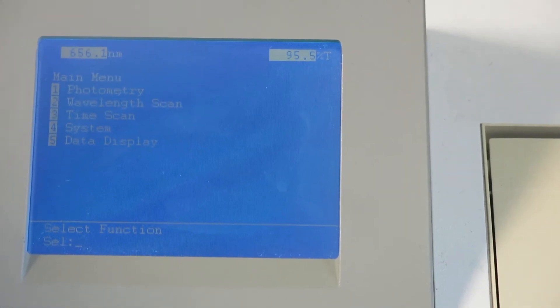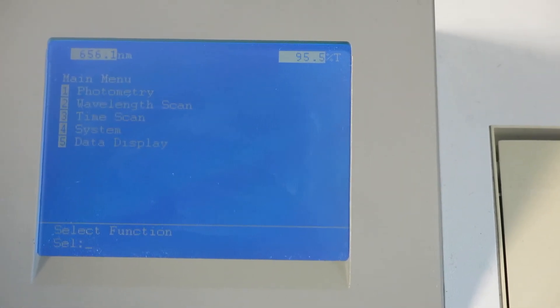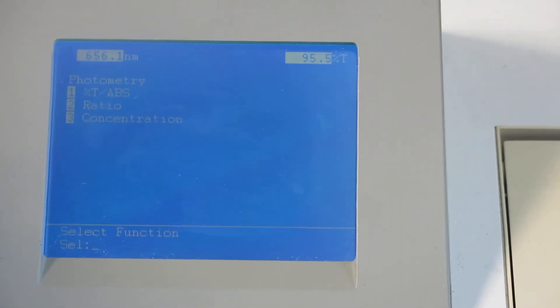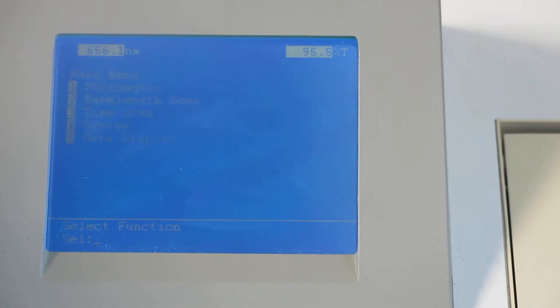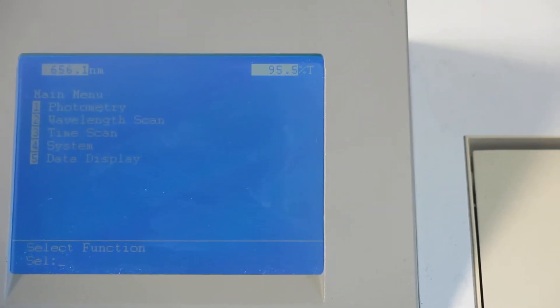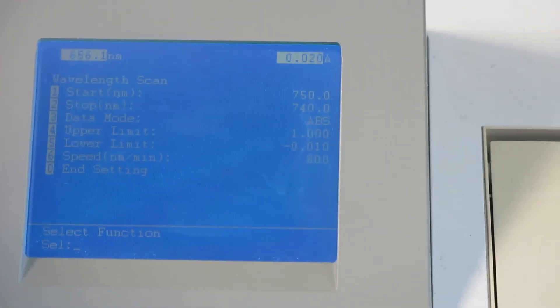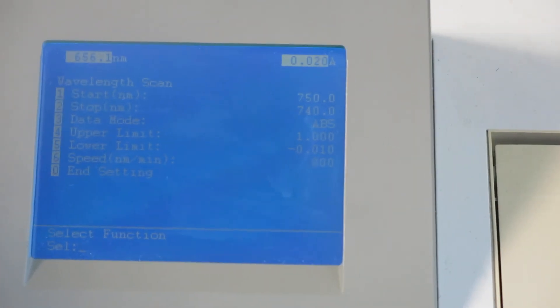Select function. Go to one, which is photometry. Stop. Go back to the main menu. Two, which is wavelength scan. Stop.